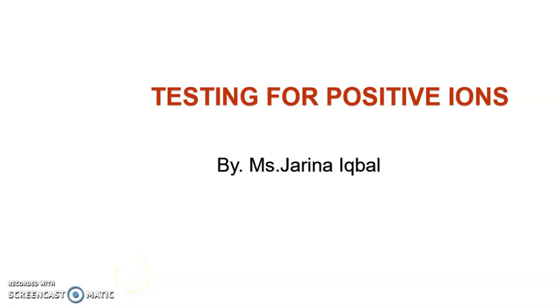Today's lesson is about testing for positive ions using precipitate formation. The precipitation tests for metal ions are based on the fact that most metal hydroxides are insoluble. Some are also colored and are therefore easily identified.